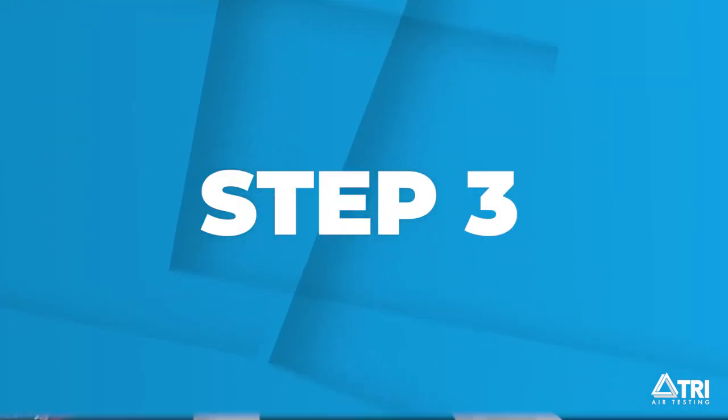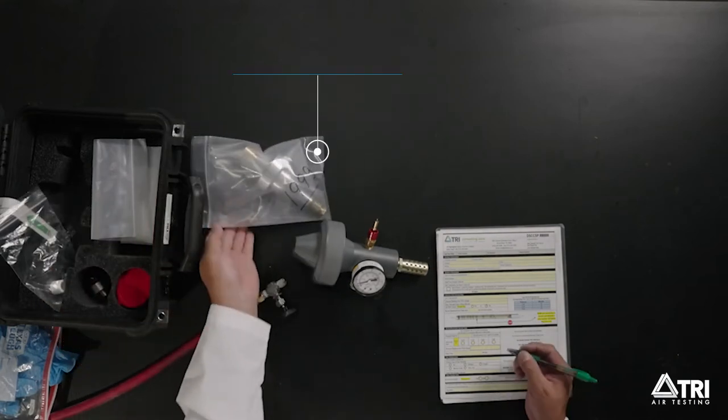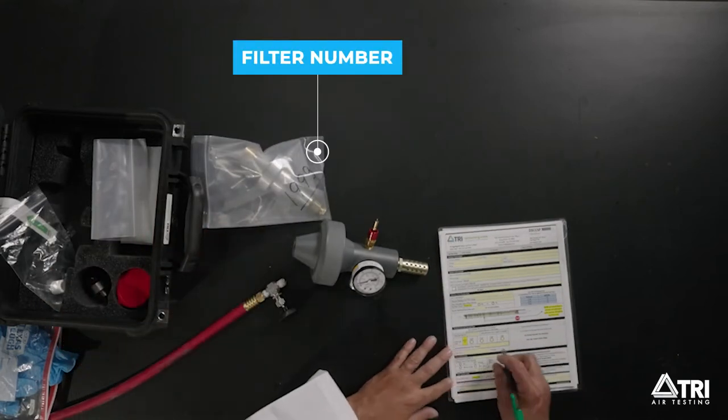Step 3. Find the filter number which is here and record that on the data sheet under mold and bacteria sample data.